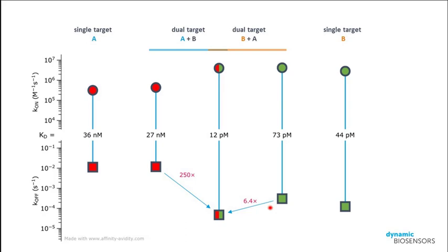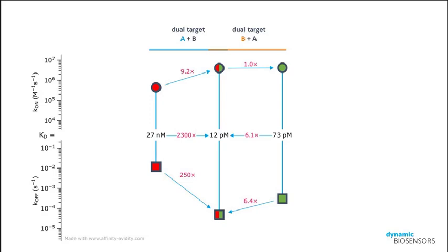What has become clear to the community working with bispecifics is that we cannot predict this avidity binding enhancement or the interplay of two arms in a single construct. Here we condense the rate overview to obtain a so-called hexagon plot, which shows the two affinity and the one avidity binding modes of a bispecific analyte in a very easy way.